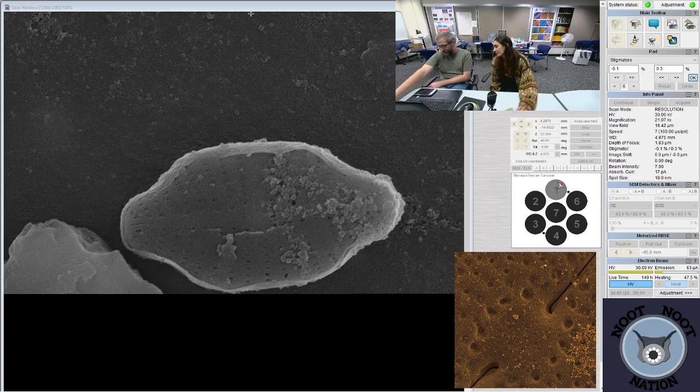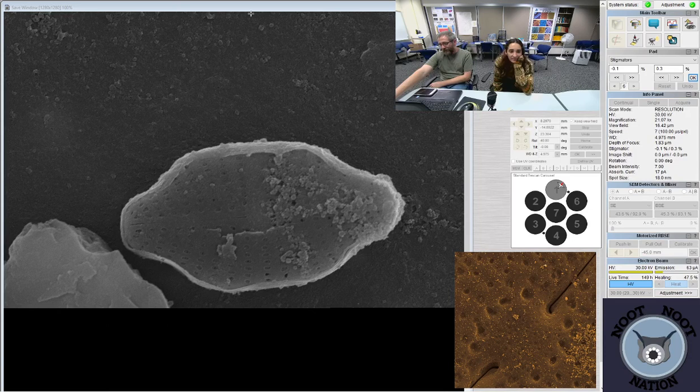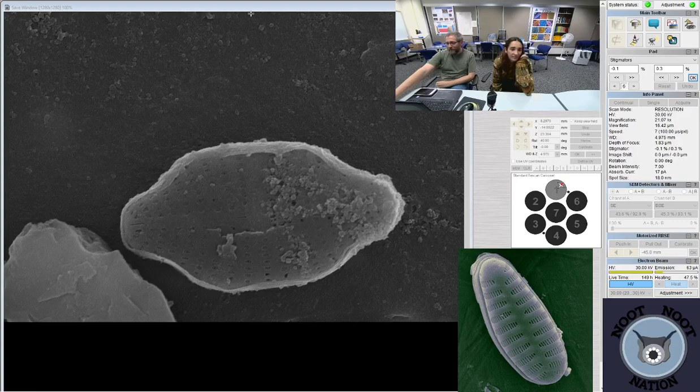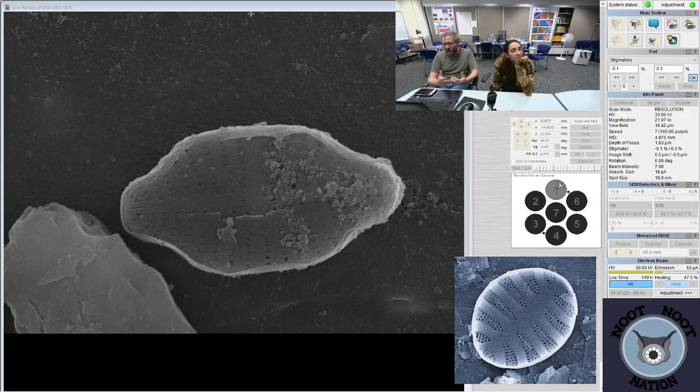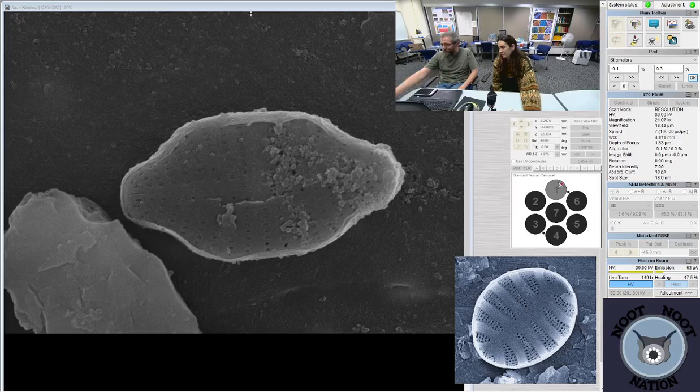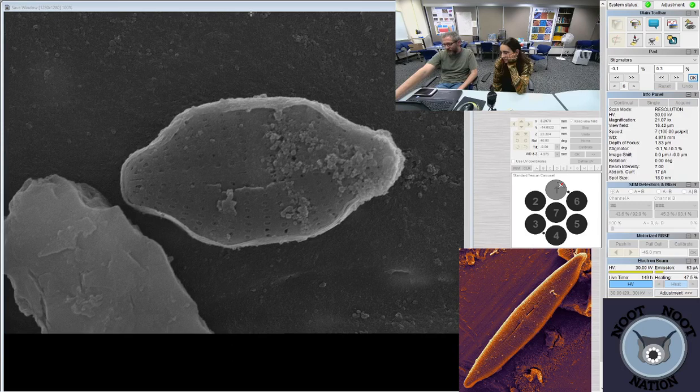How do you coat the samples? We use a sputter coater, Rex. Earlier, I did a little tour of the lab. It's over there. It has a piece of metal. We put a charge through it. It creates a plasma cloud, and then it basically coats the sample in whatever the plasma cloud is made of, in this case gold. It also happens in a vacuum with a little hole in it to let the air in.